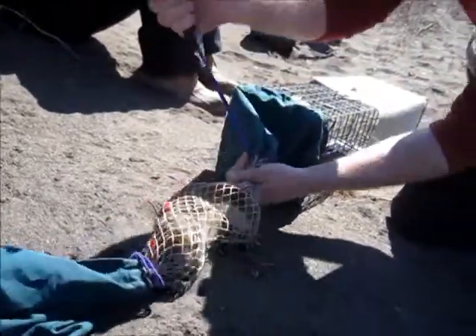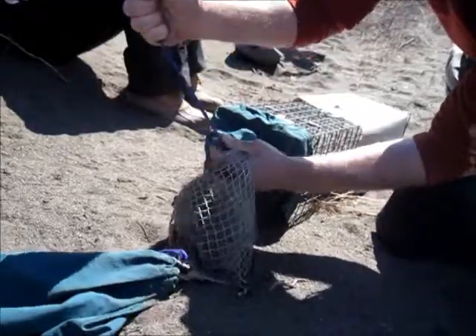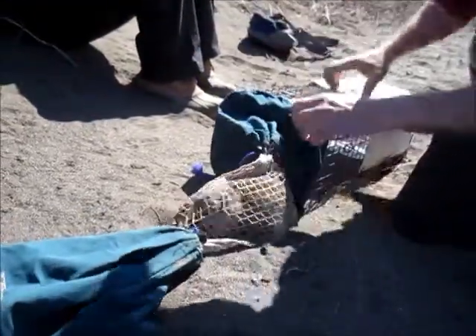Okay, the first thing you do is tighten the second thing, so now it's just trapped in the mesh pocket. Then you can take it off the trap.